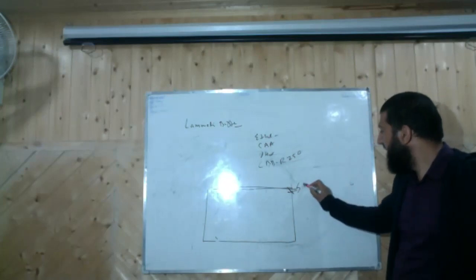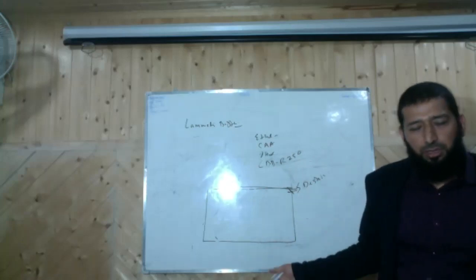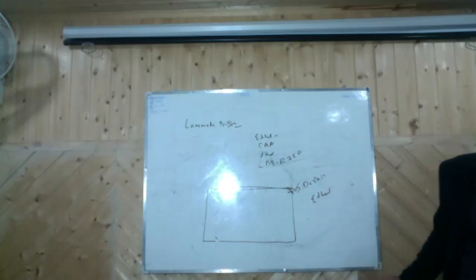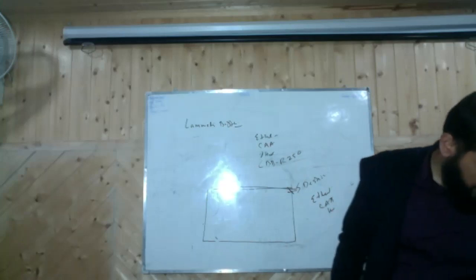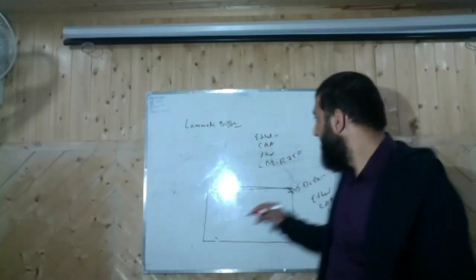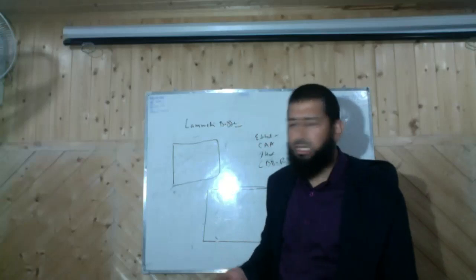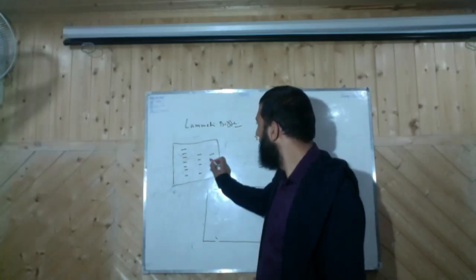Then there's a process we call destaining. After staining, we destain the excessive staining solution with the help of a destaining solution that comprises of ethanol and glacial acetic acid and water. So you put it for a while, till you see that your bands are blue, but the gel is water colored. And then you'll be able to see it under a white light illuminator, or also on a white sheet of paper. But usually we can use a gel doc also to image this, and you will see blue bands of proteins separated according to their molecular weight.